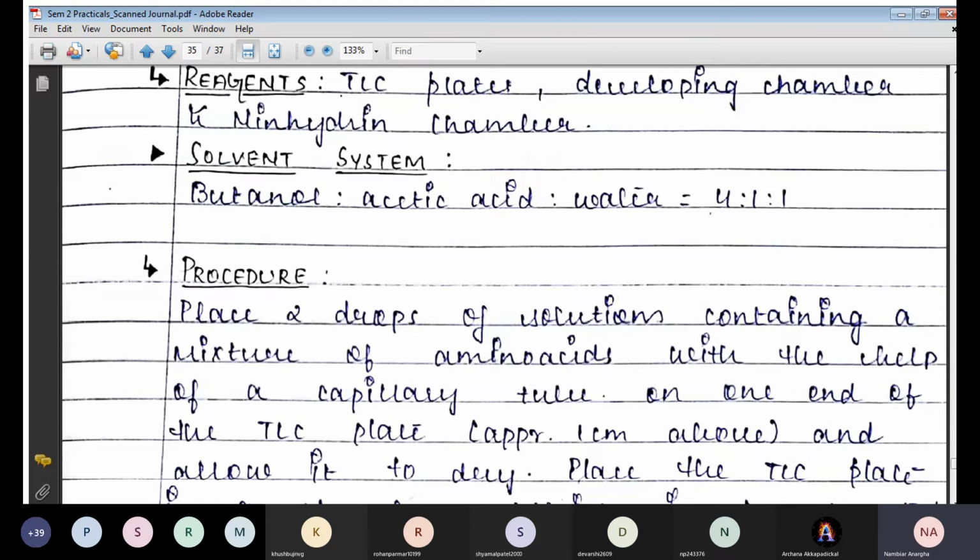Okay, you people are absolutely right. In our body also we have amino acids, about 20 different types of amino acids. So the finger also has them. When it comes in contact with ninhydrin, the amino group of amino acids in our finger also reacts with the ninhydrin solution, so it turns blue in color. Is it clear?